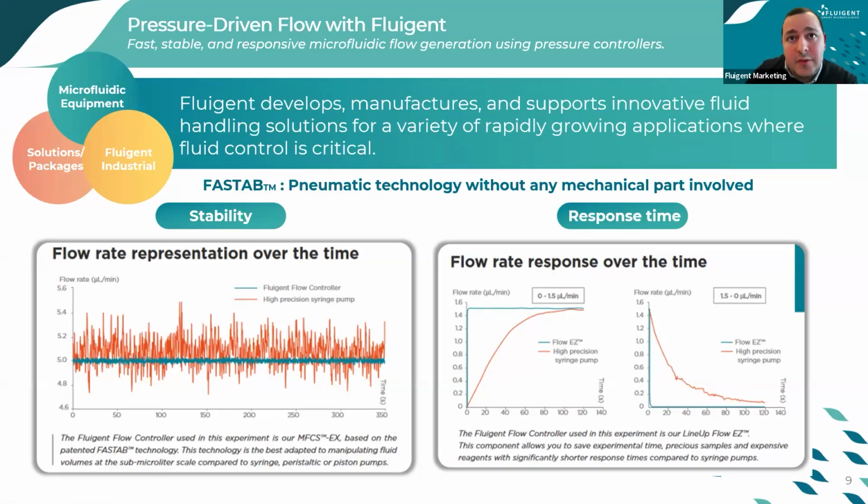What we'll discuss today, and what will be a plus, is that pressure-based flow controllers can now be easily integrated with flow sensors, and this can be a way of introducing automation throughout the experiment through dedicated software or the classical coding protocols that are on the market, ensuring precise monitoring and easier handling compared to the classical methods.